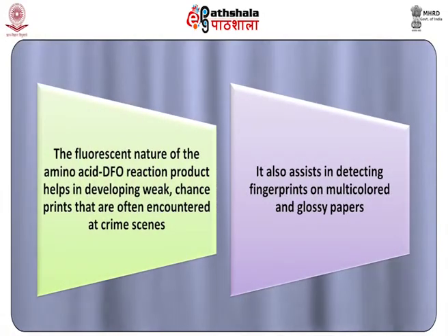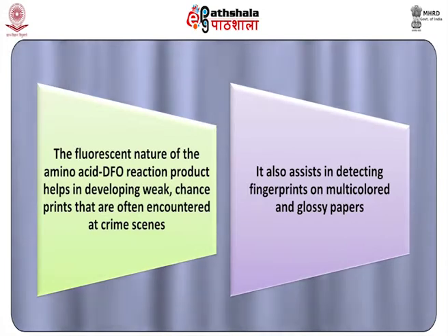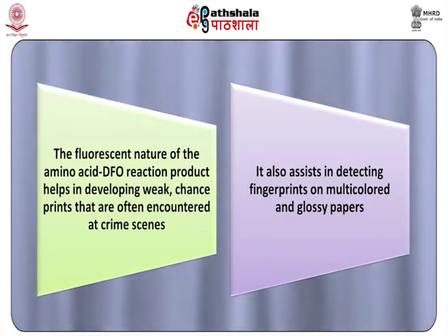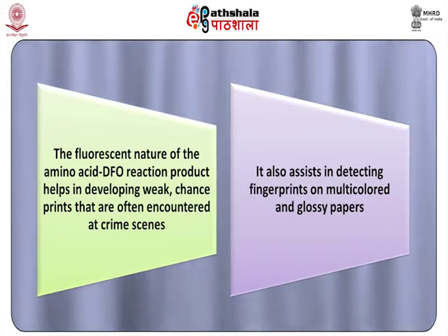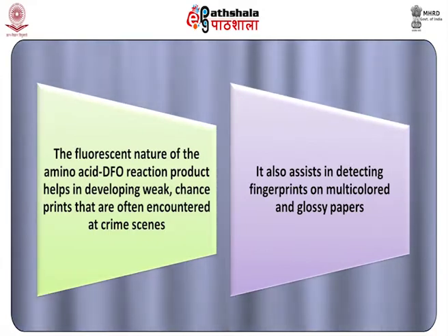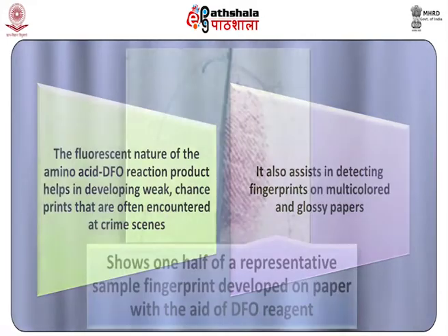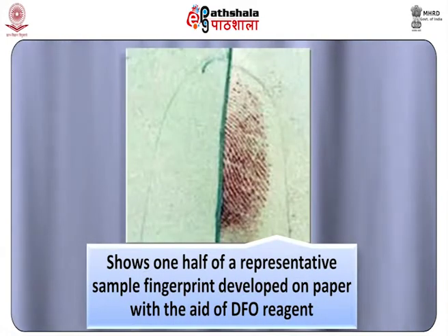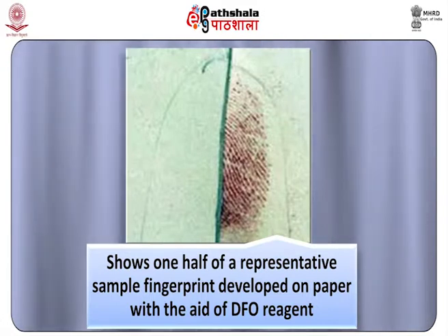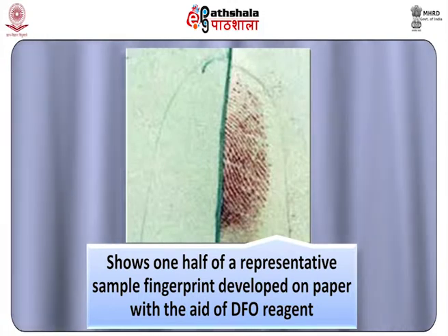The fluorescent nature of the amino acid DFO reaction product helps in developing weak chance prints that are often encountered at crime scenes. It also assists in detecting fingerprints on multicolored and glossy paper. The figure shows one half of a representative sample fingerprint developed on paper with the aid of DFO reagent.